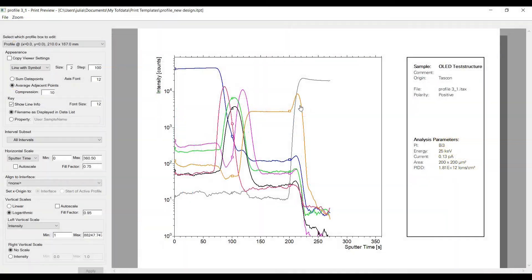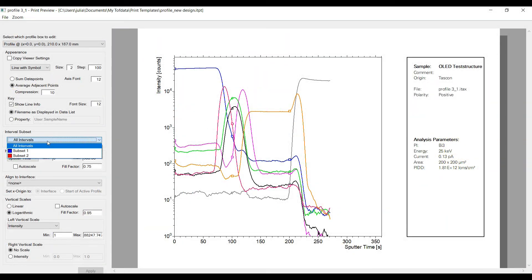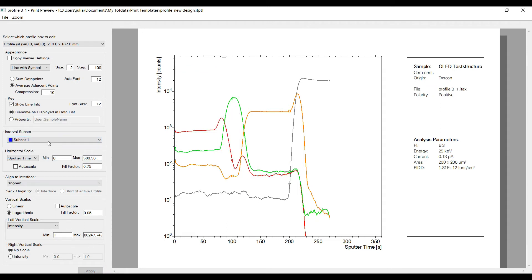If you have defined mass interval subsets beforehand you can select them also in the print preview. Please watch our tutorial about mass interval subsets for more details.